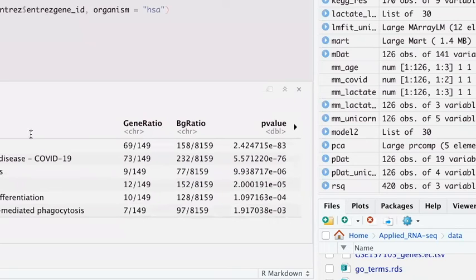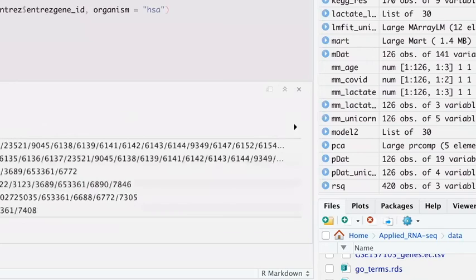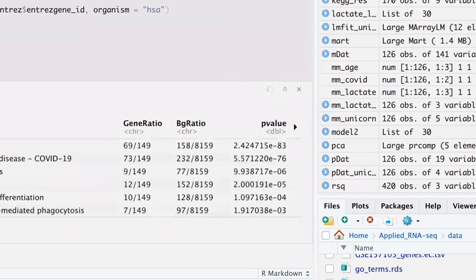And you can look at the description of all of these different columns online. It's quite comprehensive. And given that KEGG is a curated database, you know that you're not really going wrong. And the results that you're getting, like multiple GO IDs to one gene, is not going to be happening because this is thoroughly looked after. And yeah, because I was able to copy paste, we are ahead of time. And so I'm open to any questions now.